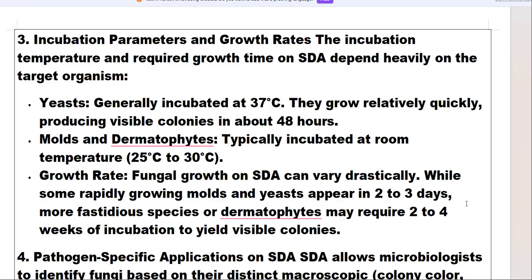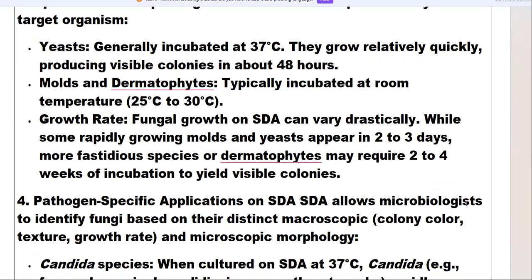Growth rate. Fungal growth on SDA can vary drastically. While some rapidly growing molds and yeasts appear in 2 to 3 days, more fastidious species or dermatophytes may require 2 to 4 weeks of incubation to yield visible colonies.